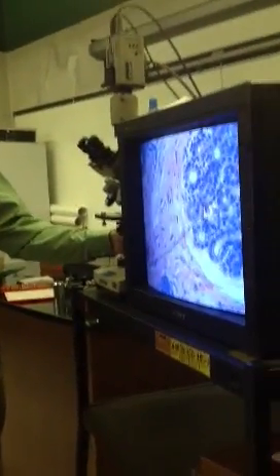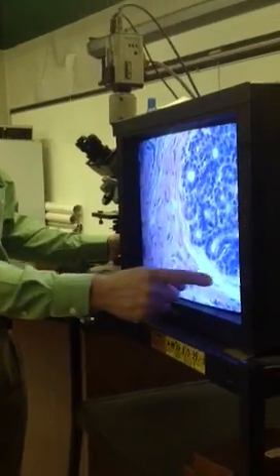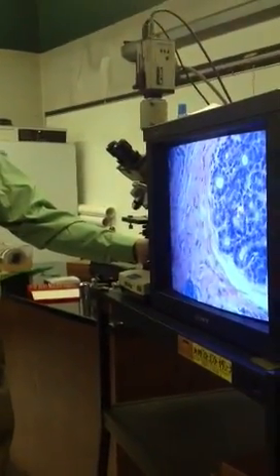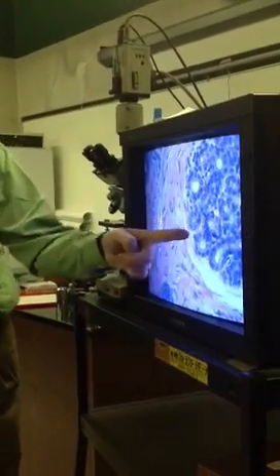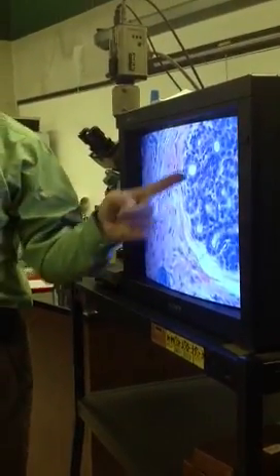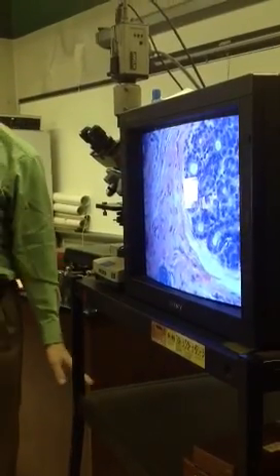And there may be some fat tissue showing. There's a little bit here. Just a couple cells maybe. But that's basically the typical view. Lots of ducts, not lactiferous, but lobulo-alveolar ducts that you can see the section through. Right?